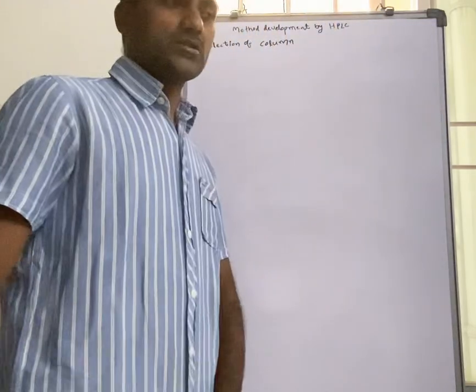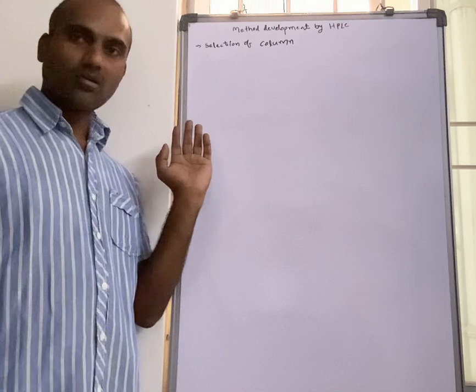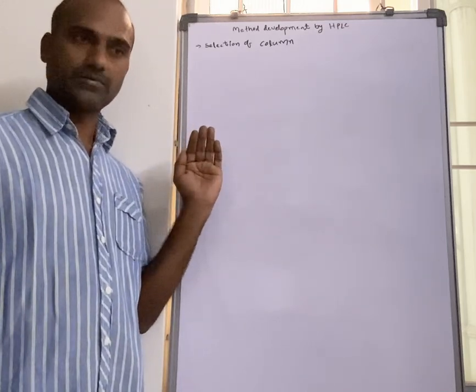So these are the basics of method development by HPLC: selection of pH, selection of buffer, and selection of column.